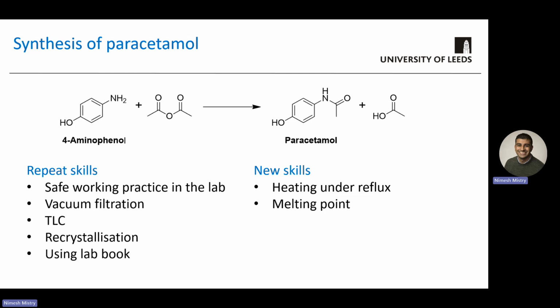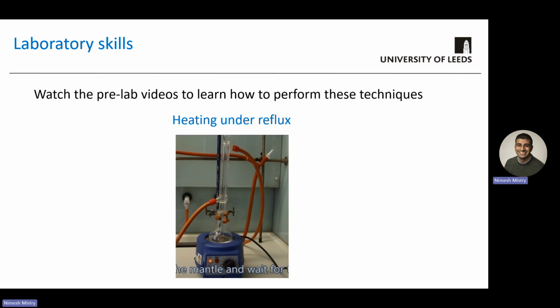In the associated theory video, we'll explain to you how we know or decide when we want to heat reactions or cool reactions, or are simply okay to allow them to stir at room temperature. Okay, so do watch the following pre-lab videos, including the theory video, but also videos that will cover the lab techniques, such as how you would actually set up and perform the key lab techniques, including how to set up a reaction under reflux.